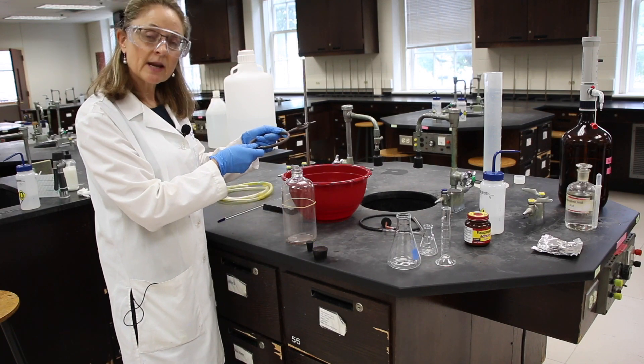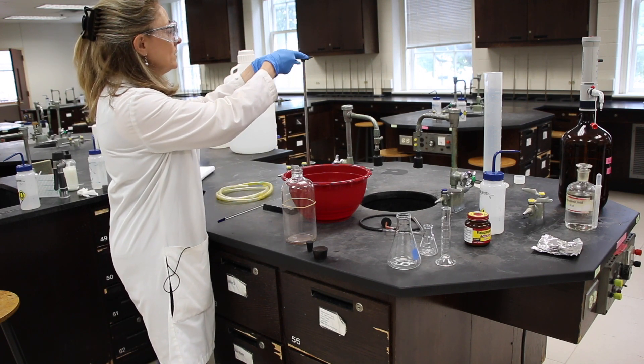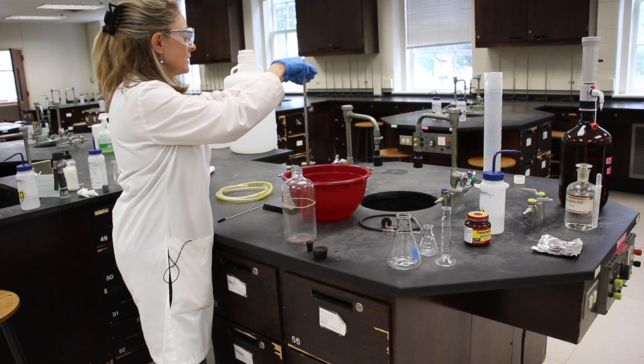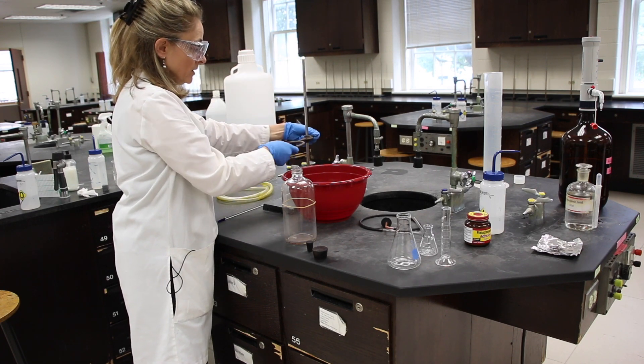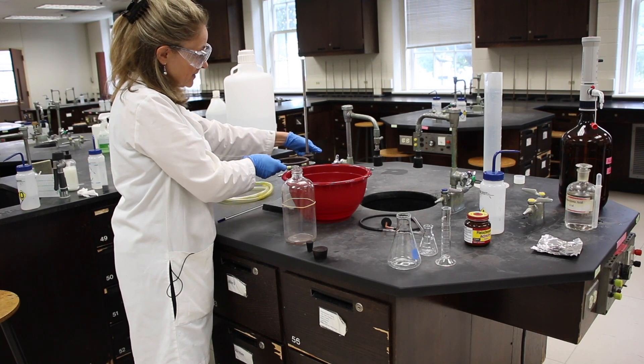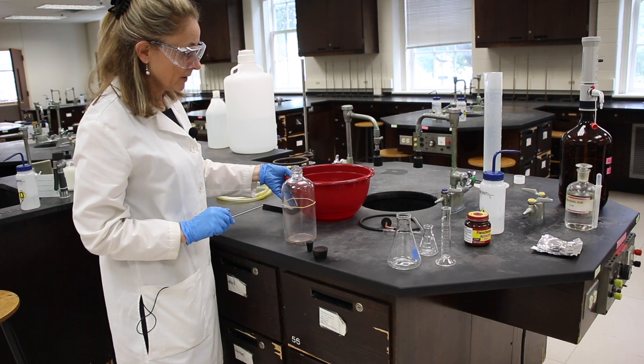I'd like you to be my lab partner and I'd like you to follow along in the lab manual. We're going to attach a ring clamp to a ring stand. We'll adjust it in a minute, but it needs to be fairly low.